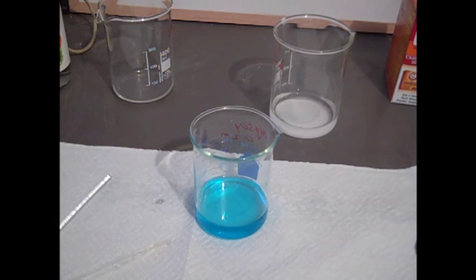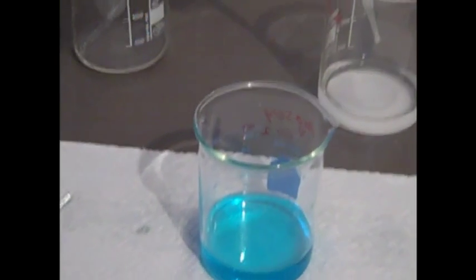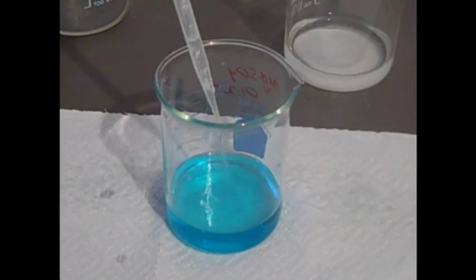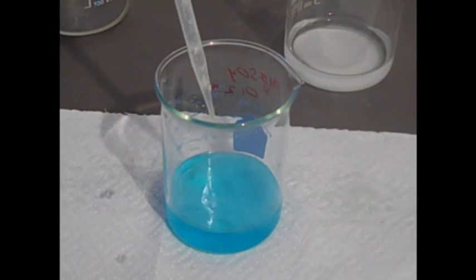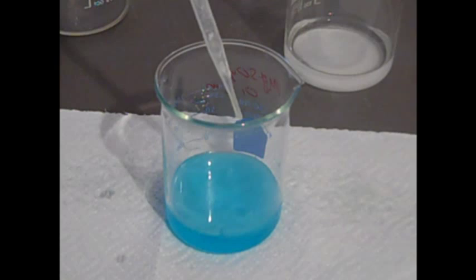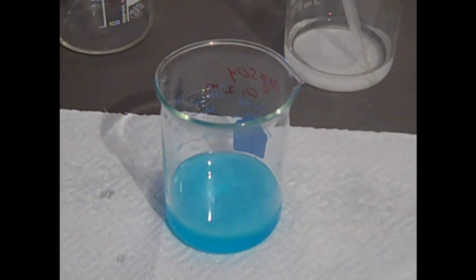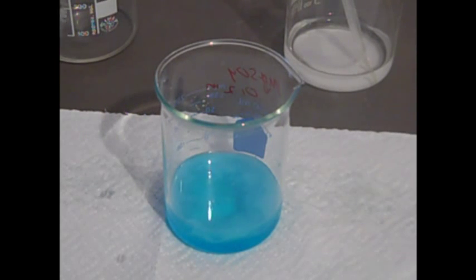Let's do that again. First, let's just put a little bit. Let's zoom in on this a bit so maybe we can see it better. A little bit of sodium bicarbonate, drop-wise. A lot of vinegar in there. Nothing happens. The vinegar is dissolving. There it goes, the sodium bicarbonate. Now we get some cloudy copper carbonate formation. See it? Now we just take the vinegar again, put the vinegar in, and I can see it dissolving. I hope you can too.